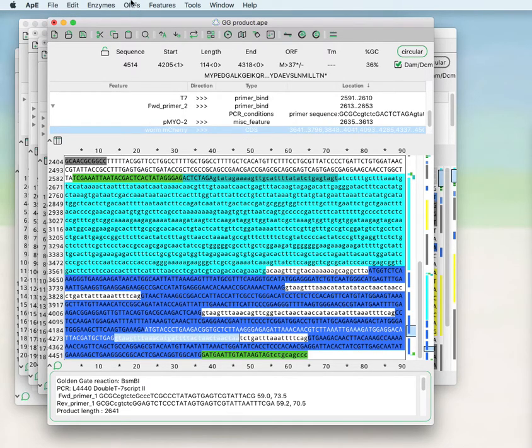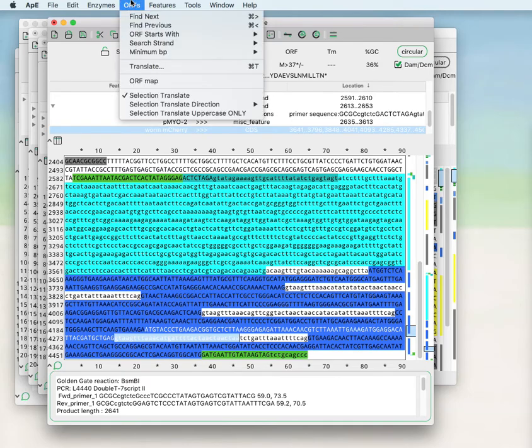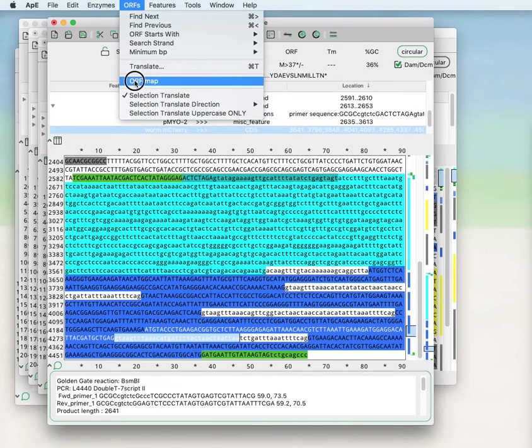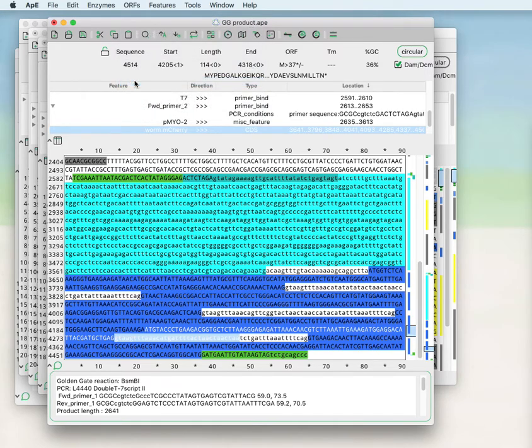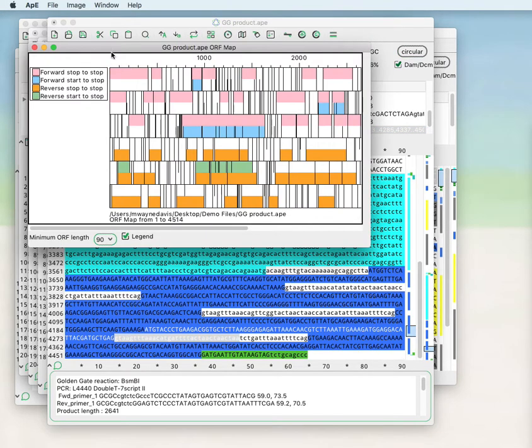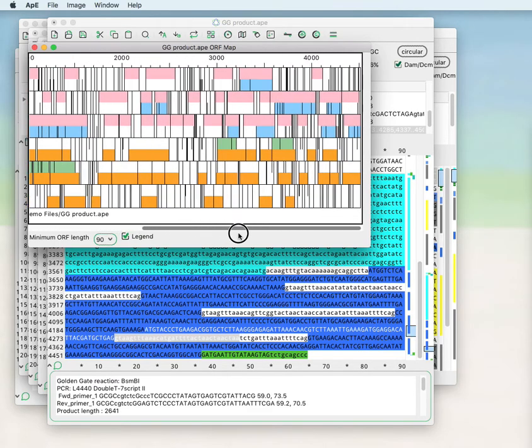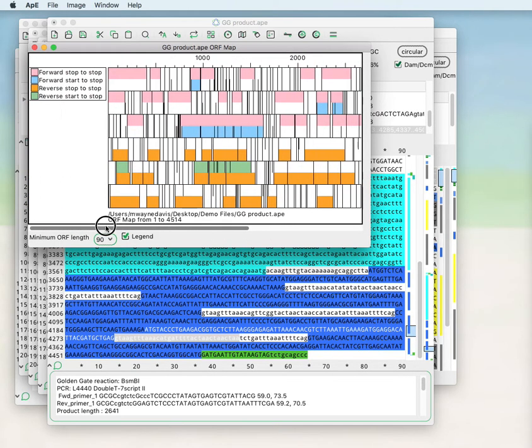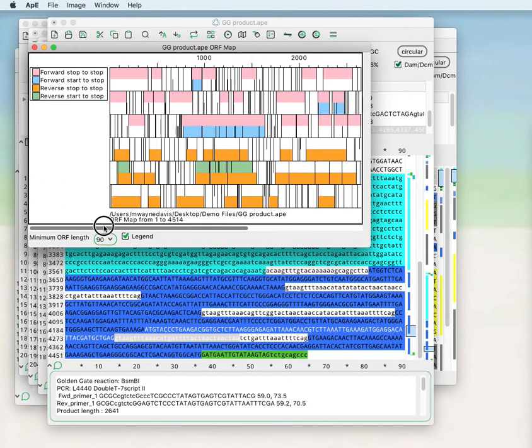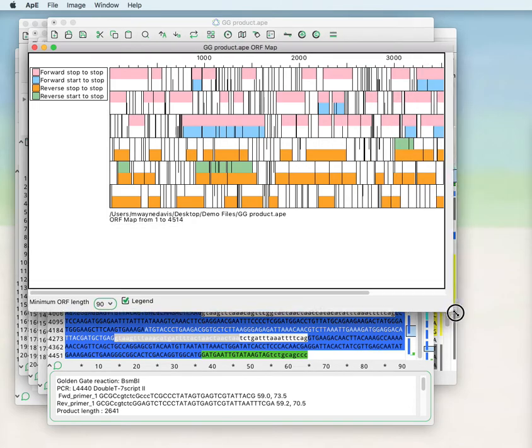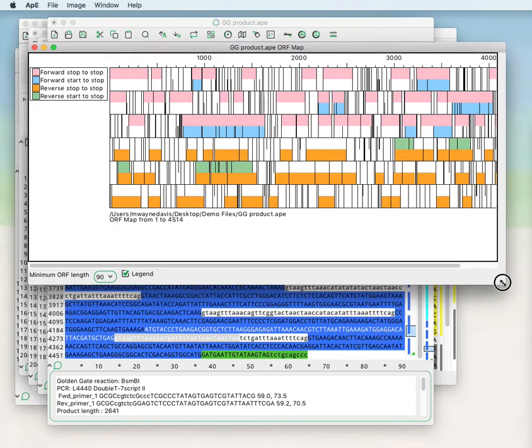If you'd like to see all of the open reading frames that are available within a particular sequence, you can use the ORF map tool. This generates a graphical representation of all the open reading frames within the DNA sequence.